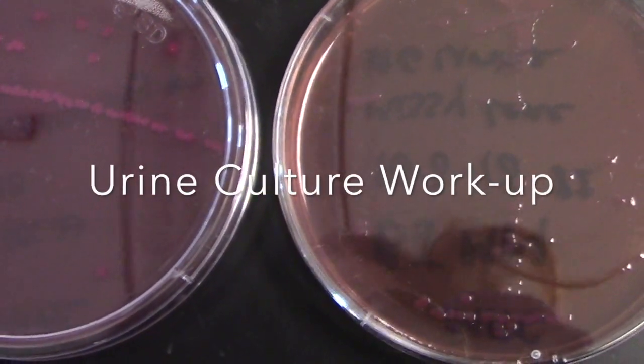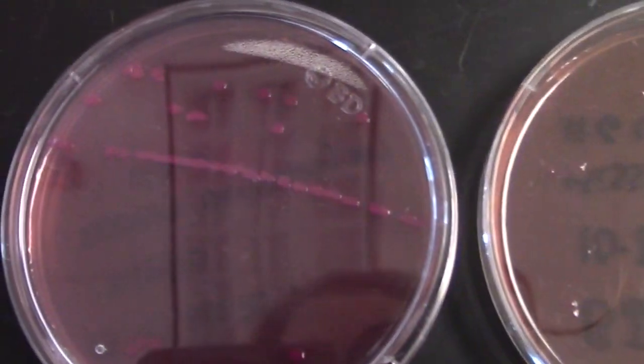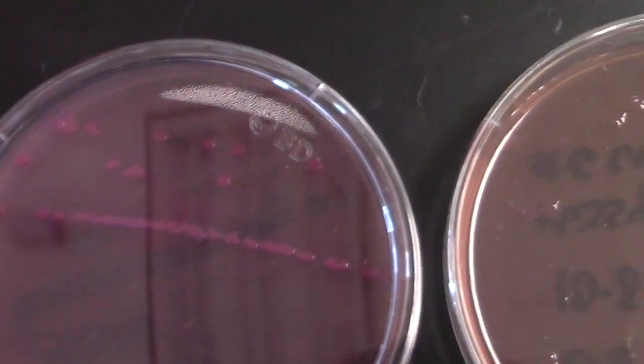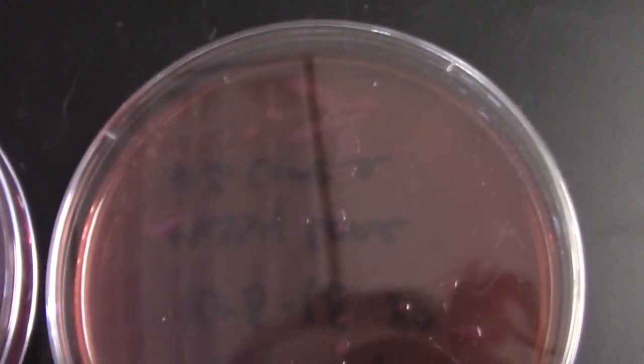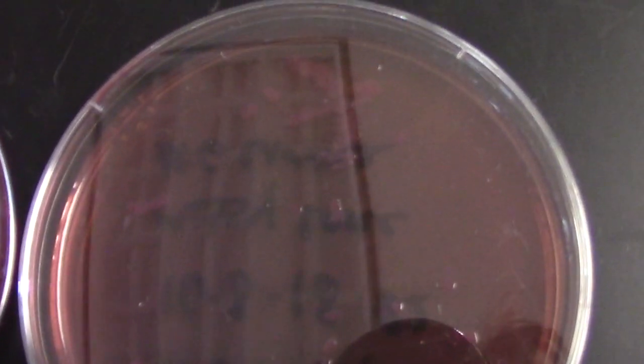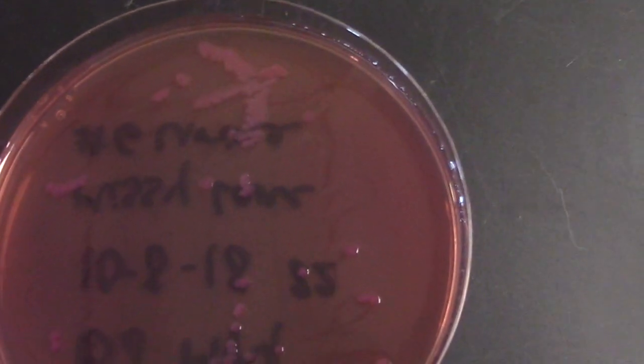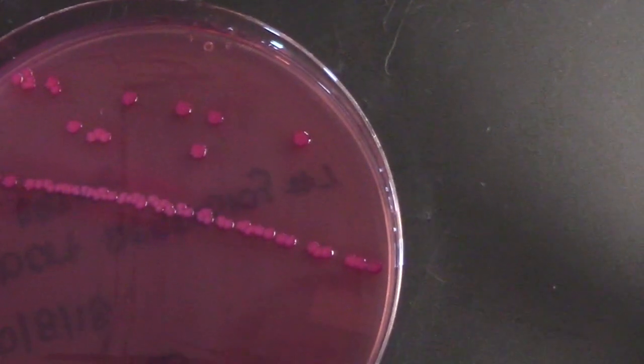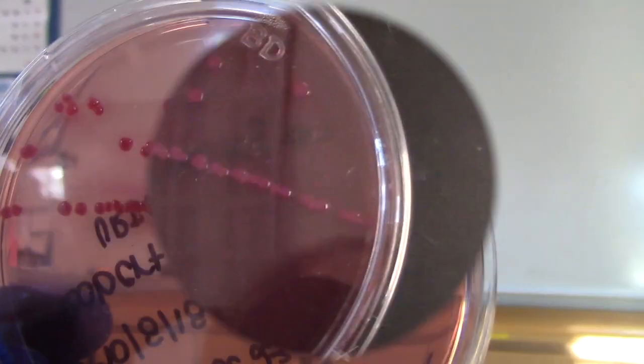As part of our urine culture workup, we're going to be looking at our cultures on the McConkey agar to look for lactose fermentation. A non-lactose fermenter is going to show tan colonies. A lactose fermenter will show dark pink-purple colonies.